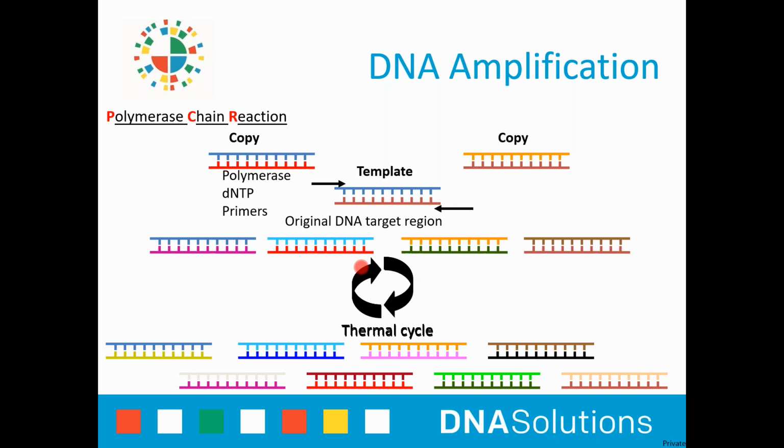And we use this thing called a thermal cycle. There's a machine that heats it up and cools it down. Every time you go through a thermal cycle, you can make another copy of it. So you originally start with one template copy, and then you get 2 copies, and 4 copies, and 8. So every round, we make double the number of molecules, and eventually we make millions of copies of the regions that have these markers on. At the same time, the system we use adds a colored molecule to the end of those copies, so we can look at them.